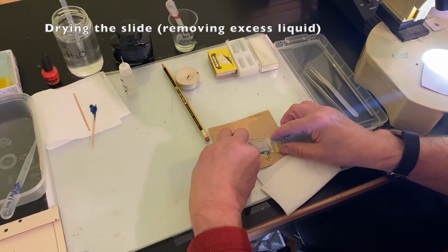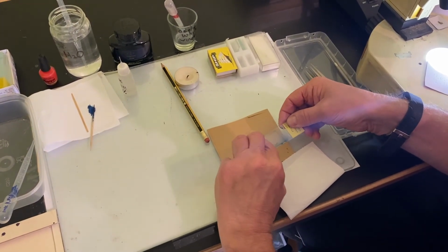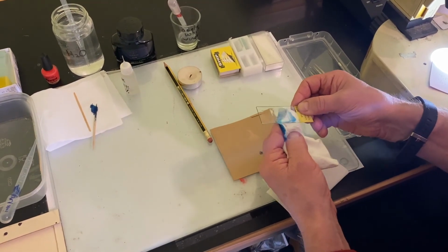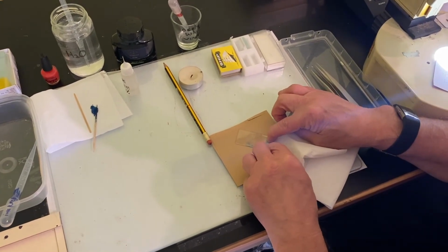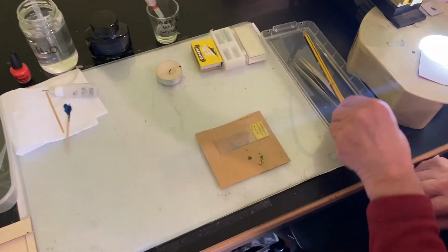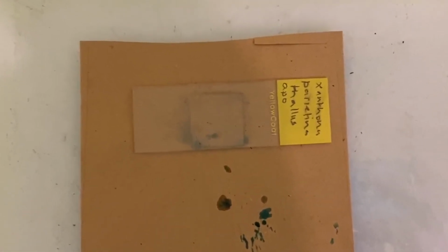Drying the slide, removing the excess liquid. Hold the slide in your hand and wipe the slide dry along the lower surface and around the cover slip edge on the top surface of the slide with the tissue. Be careful not to wipe the cover slip off when you do this, which is quite easy to do. It is quite easy to knock the cover slip a small amount, but as long as it's not knocked off, just reposition it.